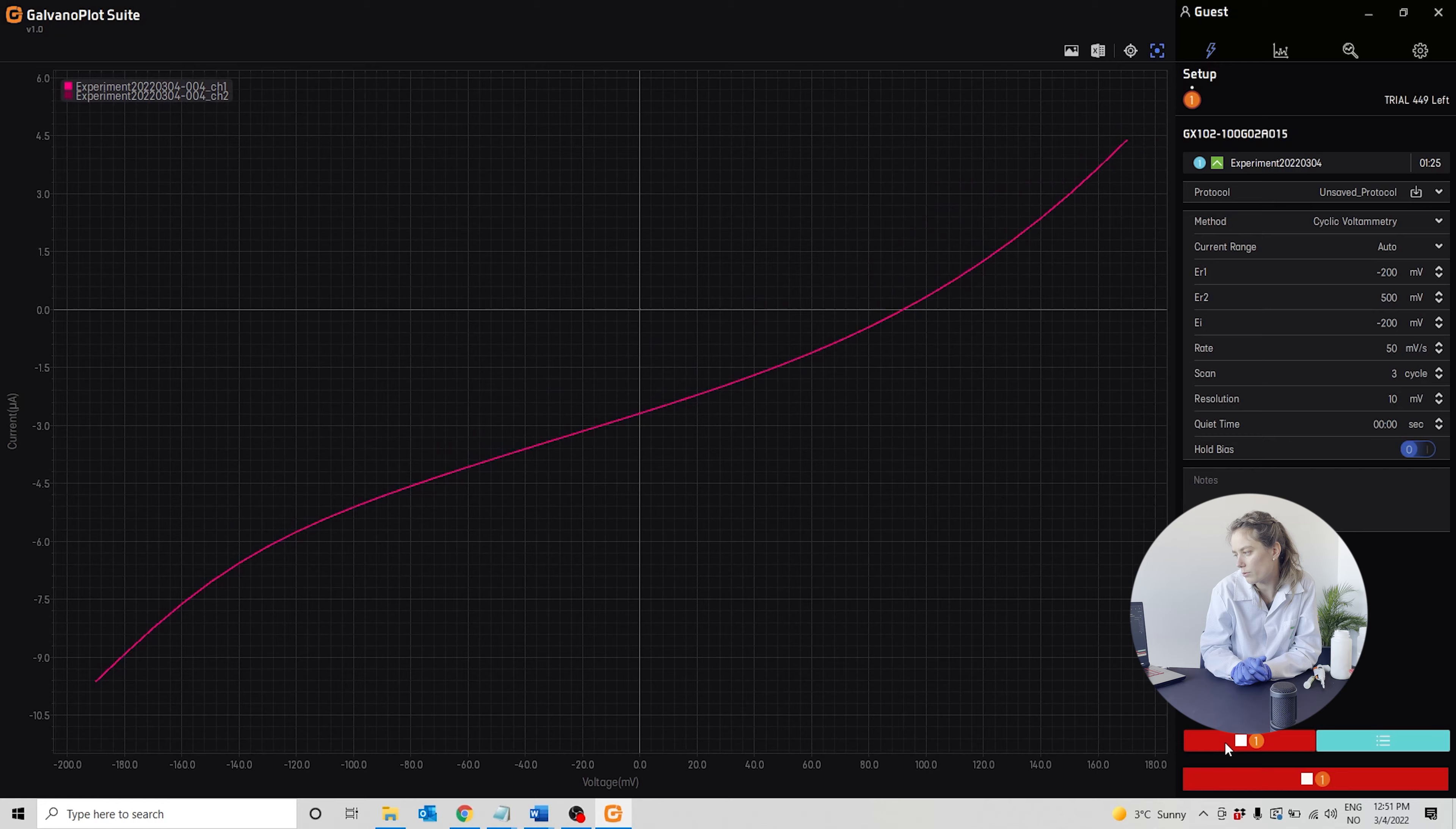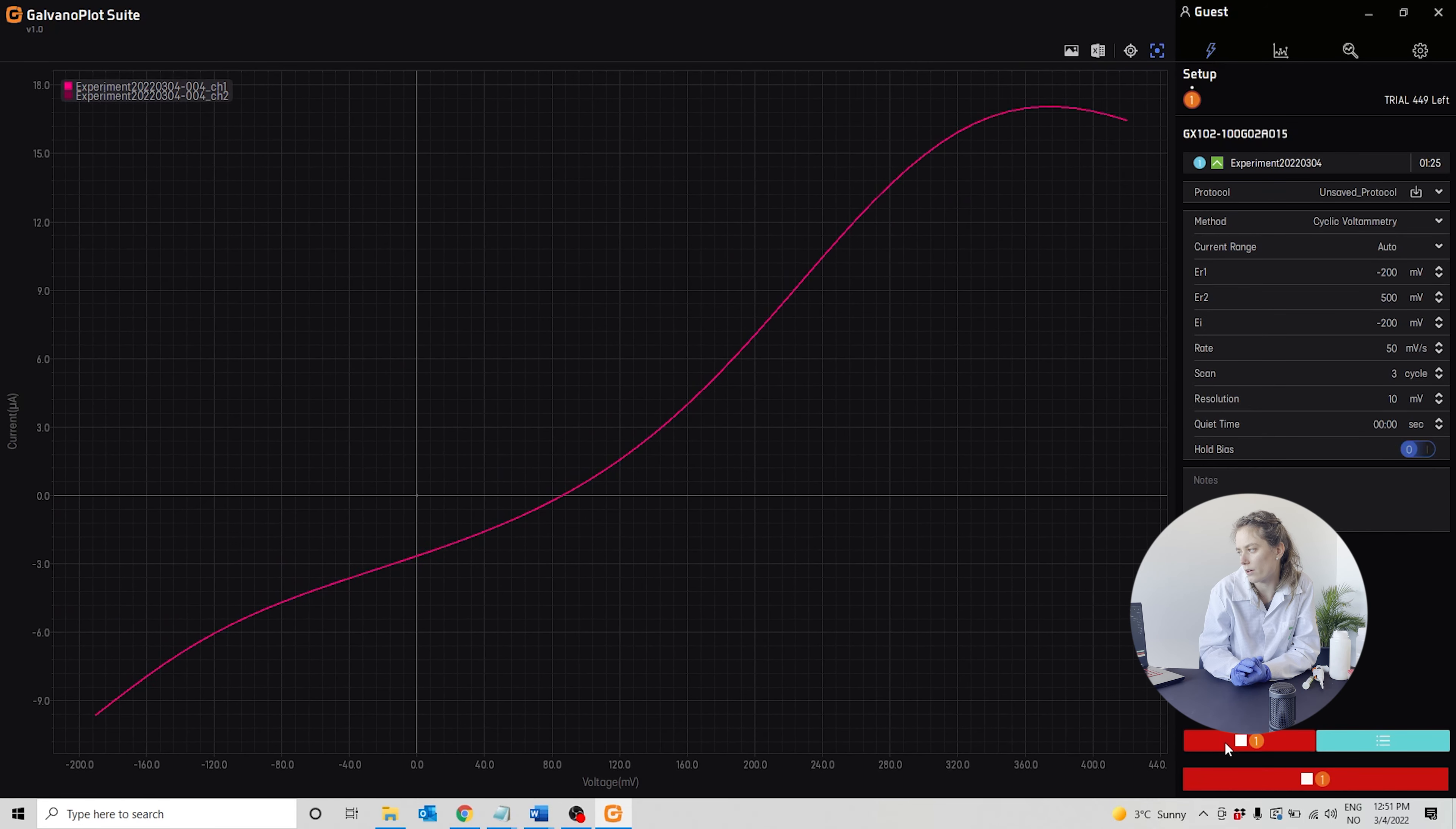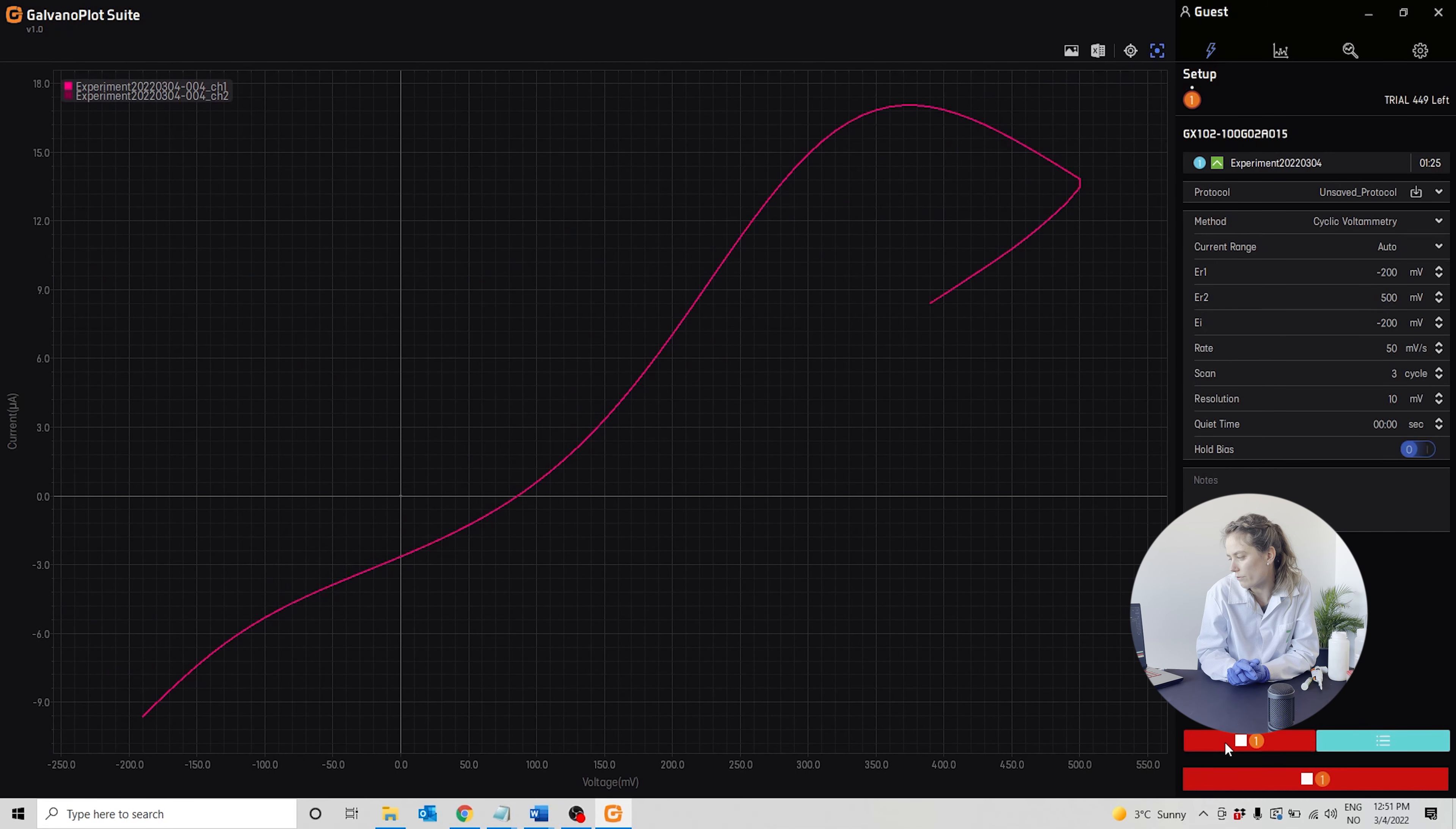Cyclic voltammetry varies the potential and measures the current response for different potentials.